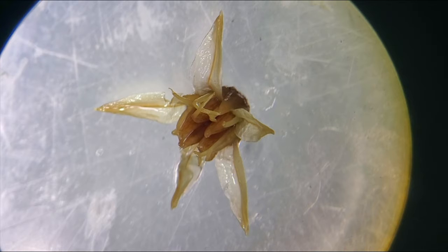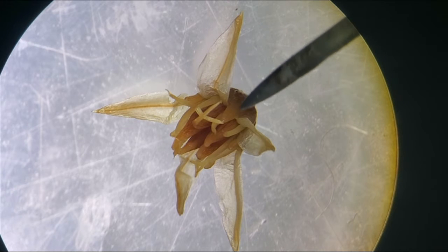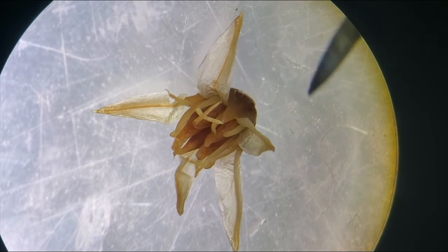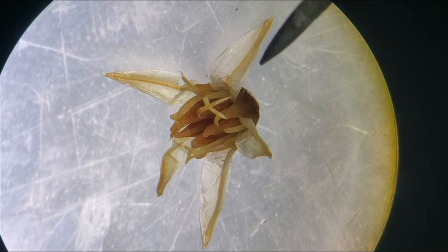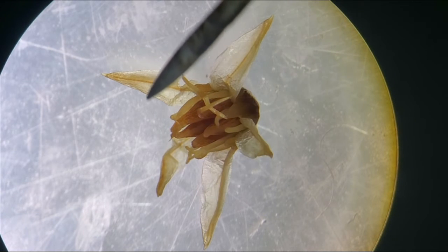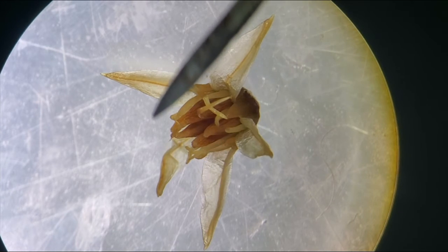So I have here under my dissecting scope a single flower of Sedum lanceolatum, which is our native species of sedum found in the area. If we look at this flower under the dissecting scope, we can clearly see all four floral whorls. First, we can see the single sepal here, which is a component of the calyx. The other sepals are kind of hidden, but they're there. So in total, there are 5 sepals. We see the next whorl, which is petals. These are the more translucent white looking structures. So here we clearly have 5 petals composing the corolla.